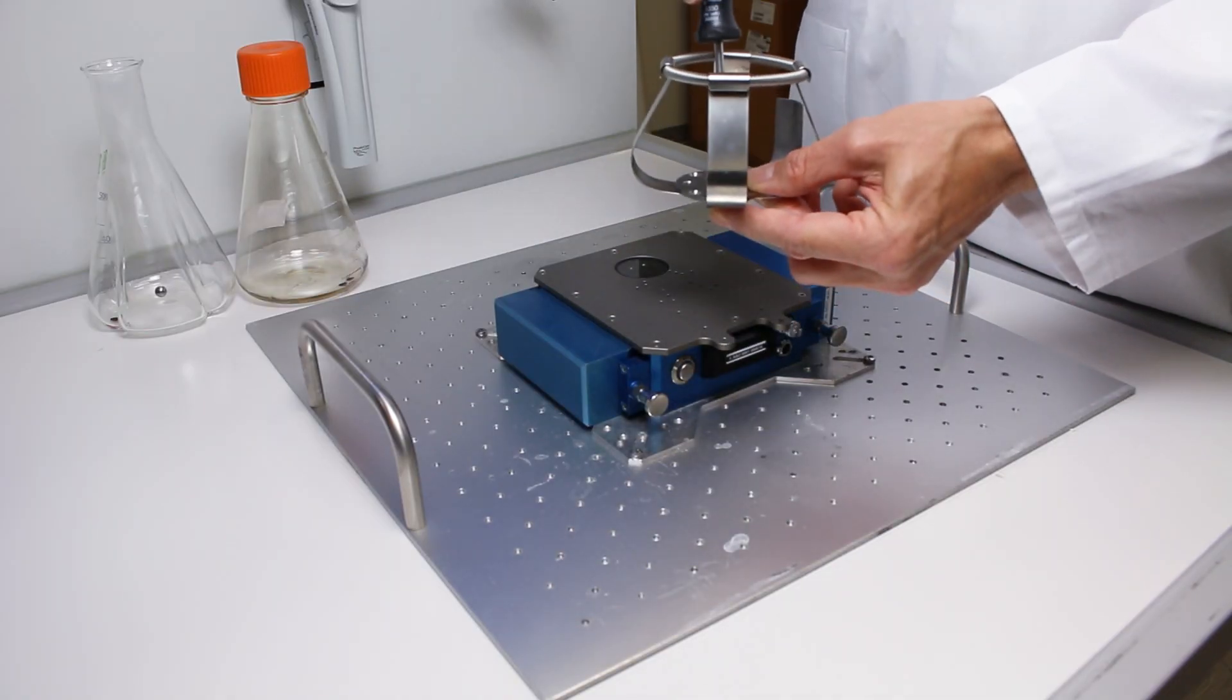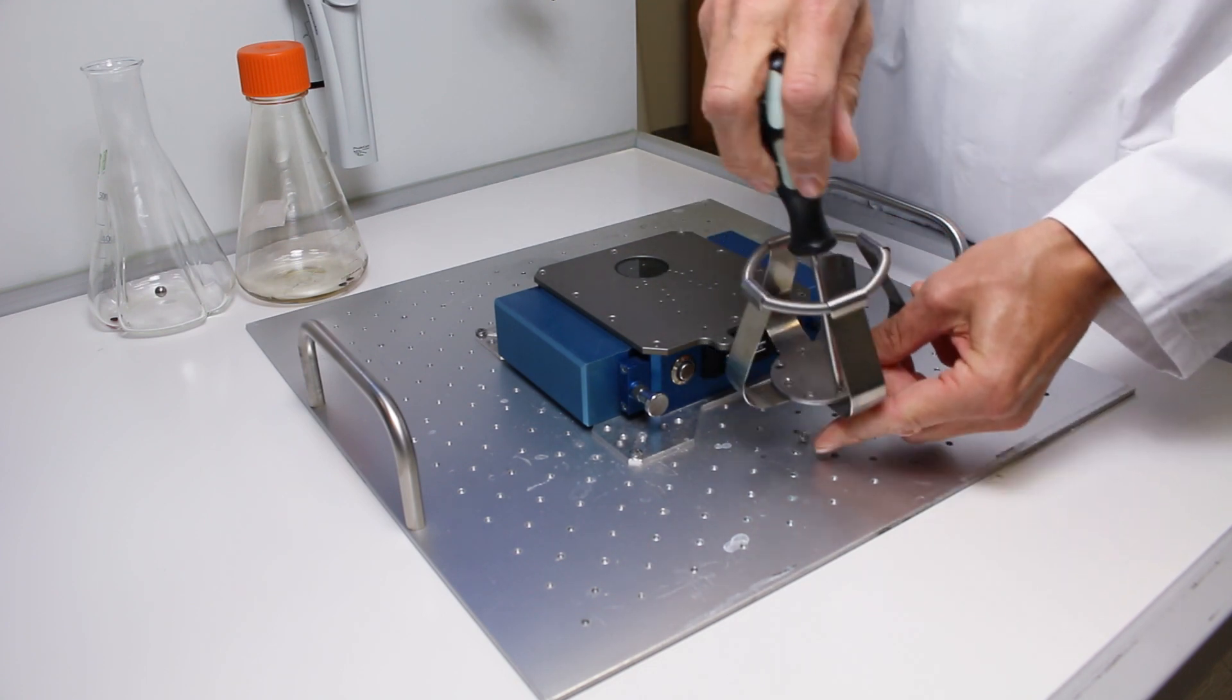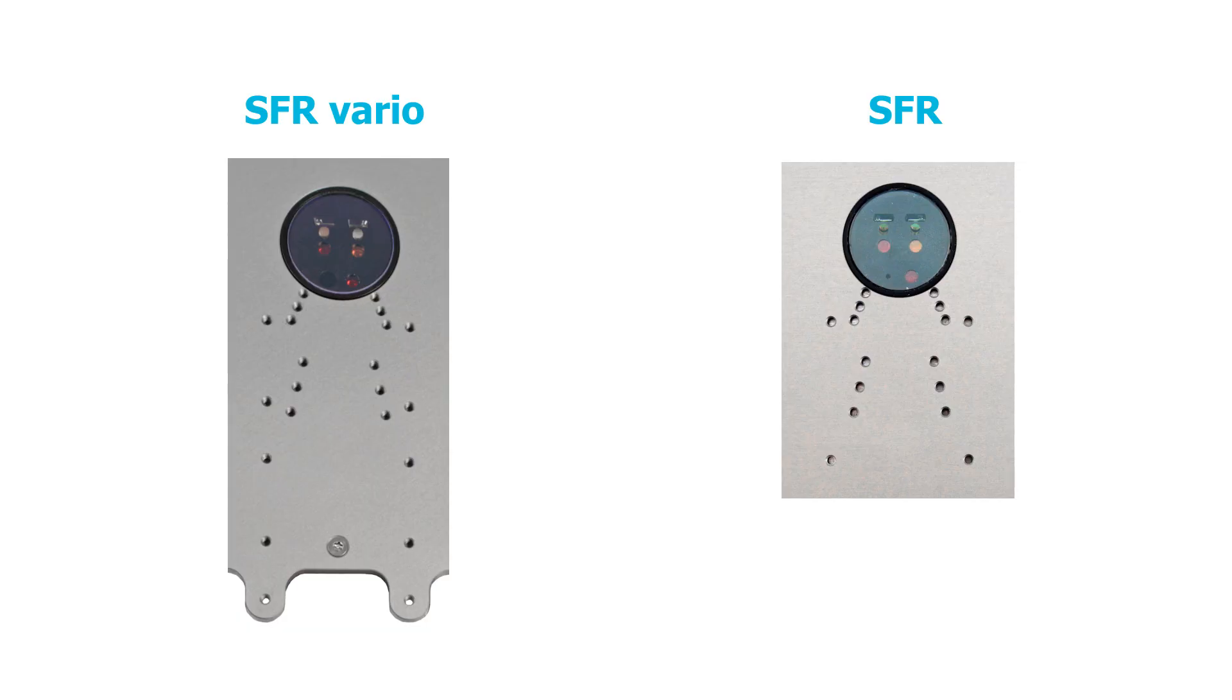Unscrew the nuts of the four M3 screws holding the base plate. Then choose the right holes according to your flask size on the SFR or the SFR Vario.